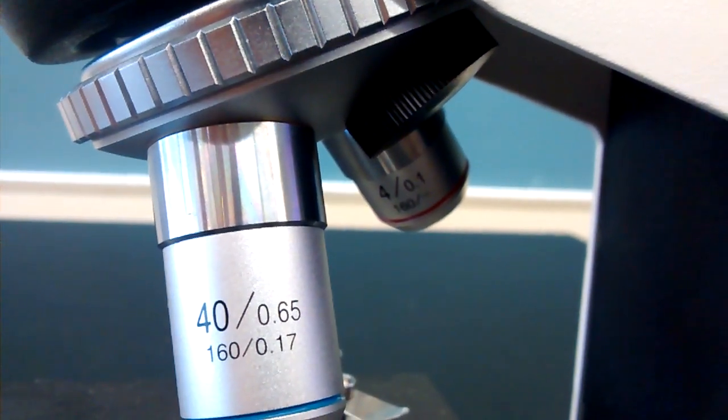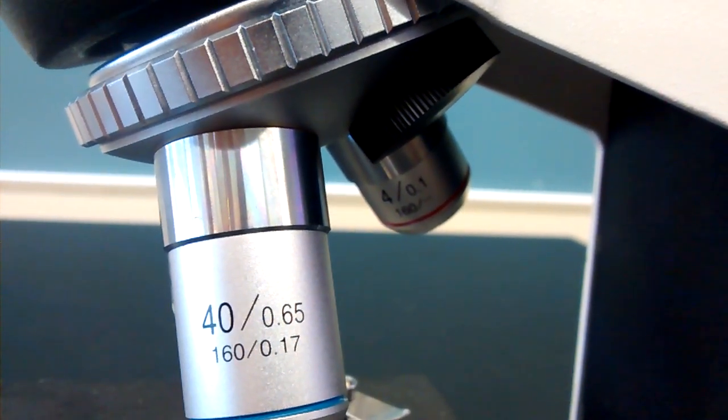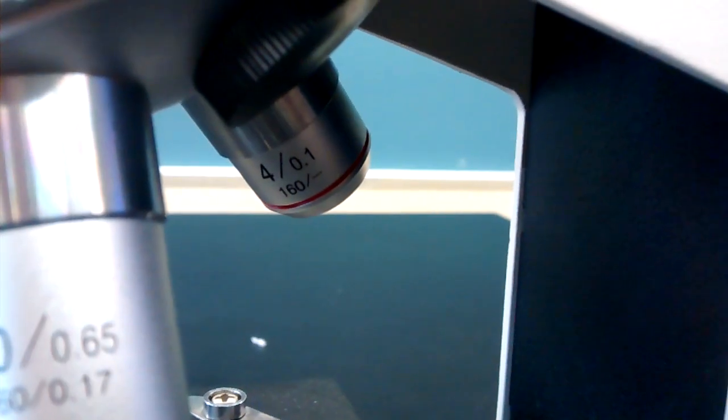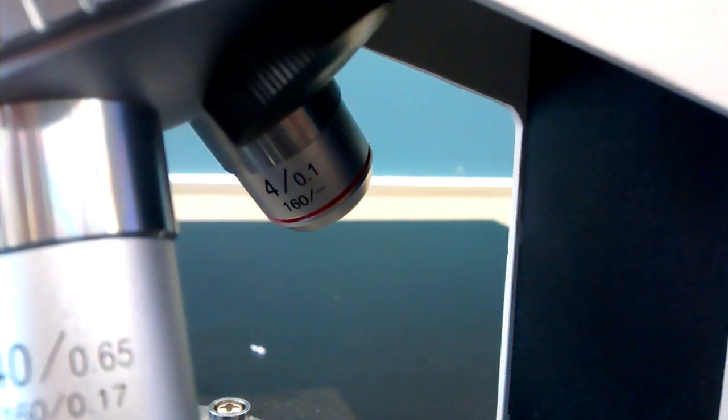What's meant by that is if we use that red banded scanning objective, it will magnify four times on its own. But you don't use it on its own. So it's four times the ten of the eyepiece. When you're using this red objective lens, you are seeing things 40 times as large as they would appear with the unaided eye.